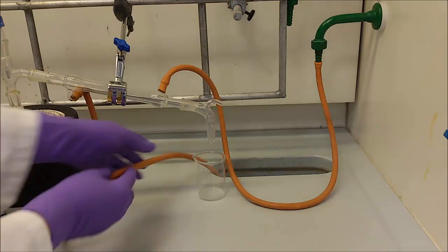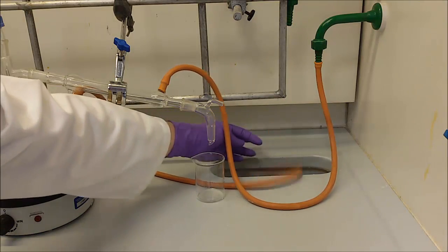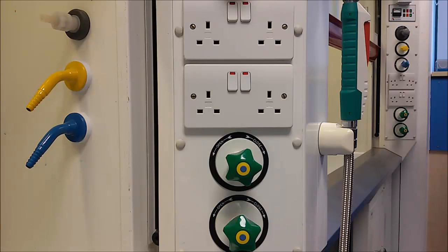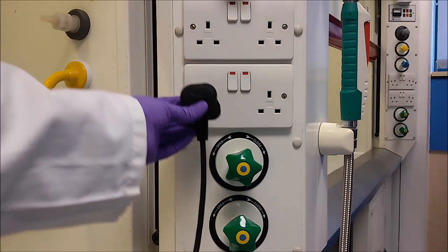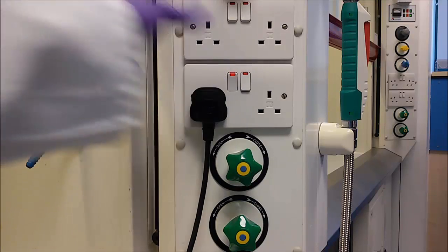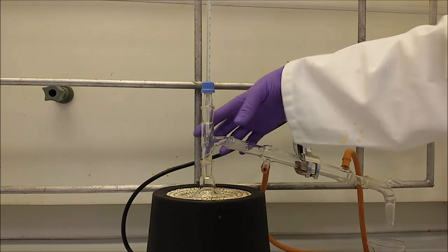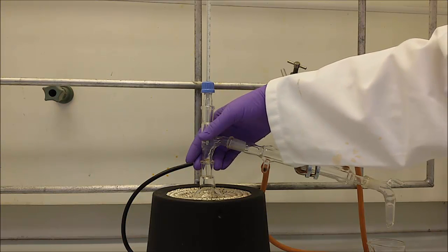Put the free ending of the tubing inside the sink. Connect the mantle to electricity and make sure that all the parts of the setup are joined well.